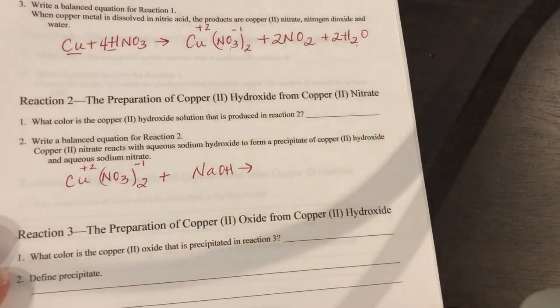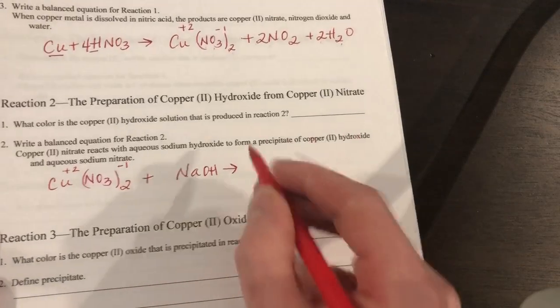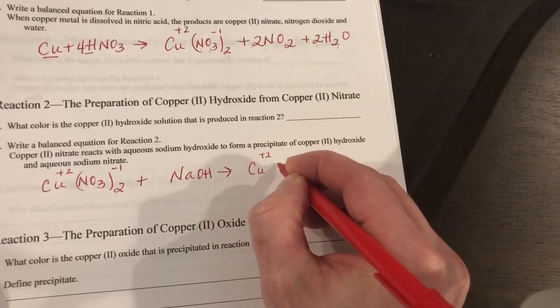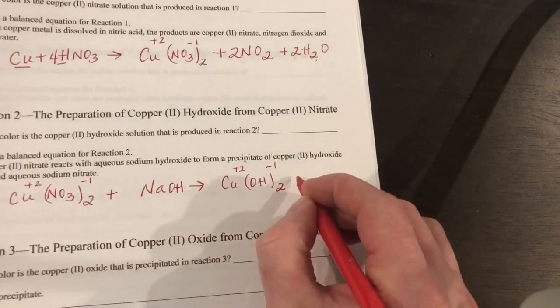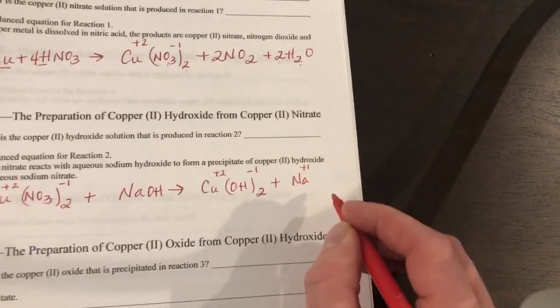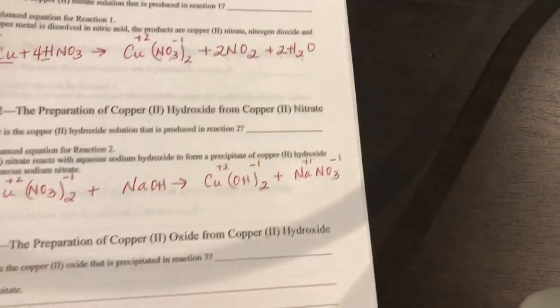Okay. Now it says it's going to form a precipitate of copper 2 hydroxide and sodium nitrate, which is Na with a +1 charge. Nitrate is NO3 with a -1 charge.